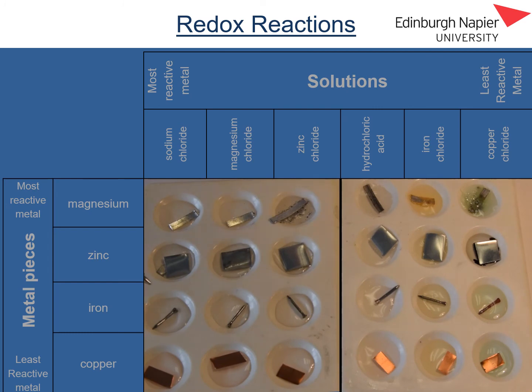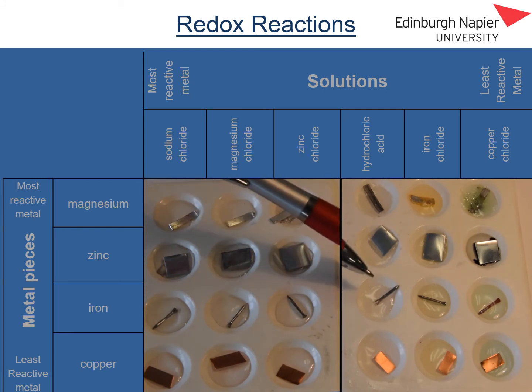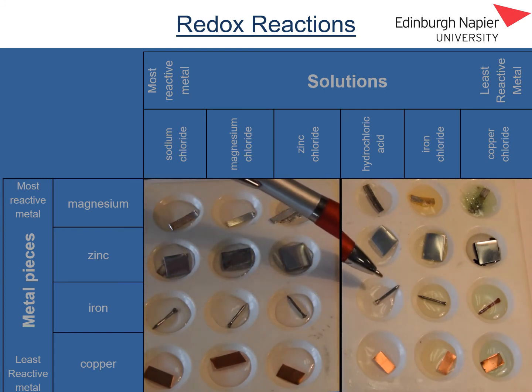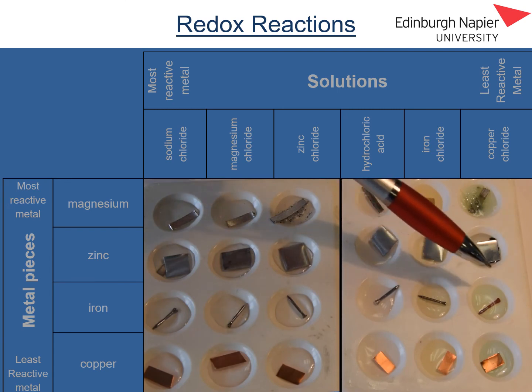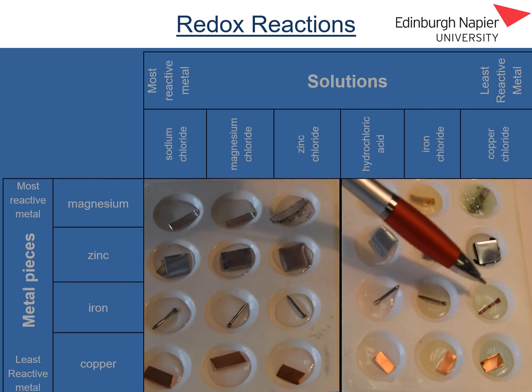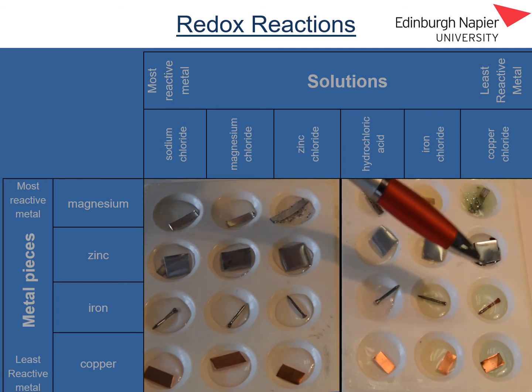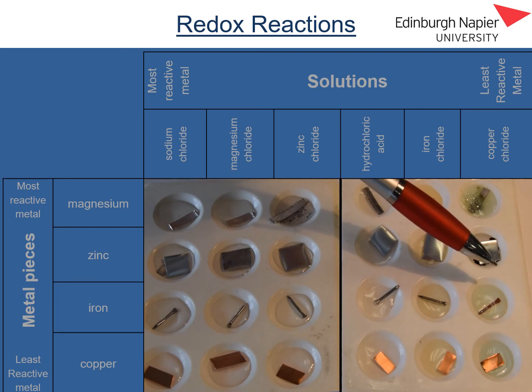Looking at iron now, there is no evidence of a chemical reaction having taken place with sodium chloride solution, magnesium chloride solution, zinc chloride solution, hydrochloric acid solution, or iron chloride solution. However, we can see quite clearly that there is a reaction taking place between the iron and the copper chloride solution — copper metal has formed on the outside of the piece of iron.